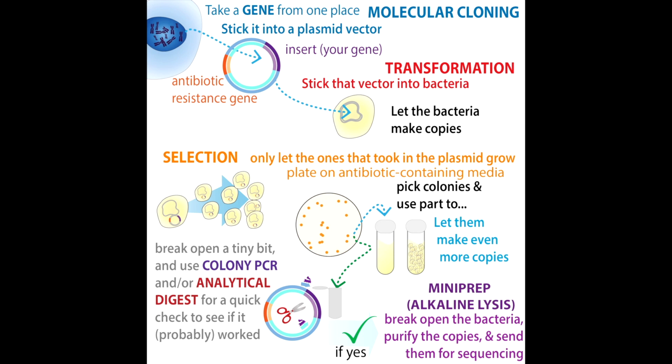And as I'll get into later, it's not technically the gene, it's the cDNA, which is an edited version of the gene. It has the regulatory information removed. So we take this plasmid, and it has the recipes for making that protein, and then we stick it into the bacterial cells. When we stick it in, we call this process transformation.